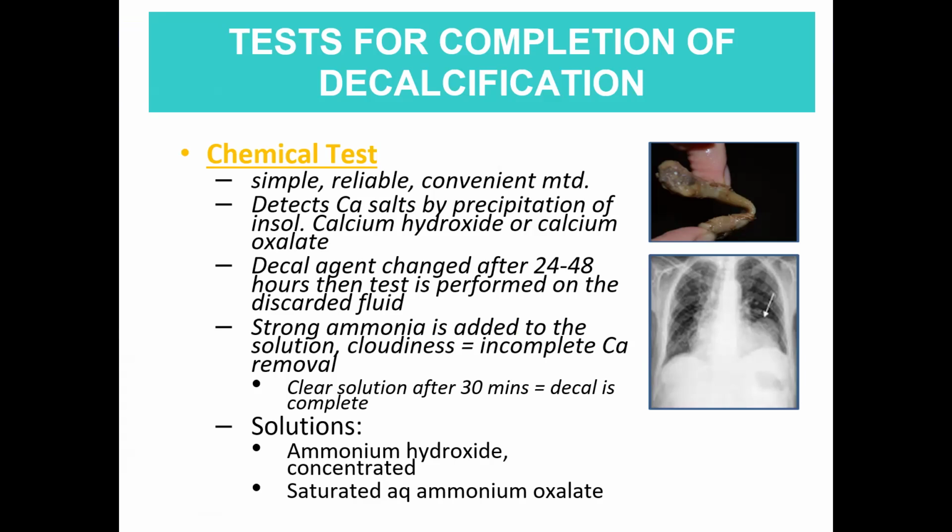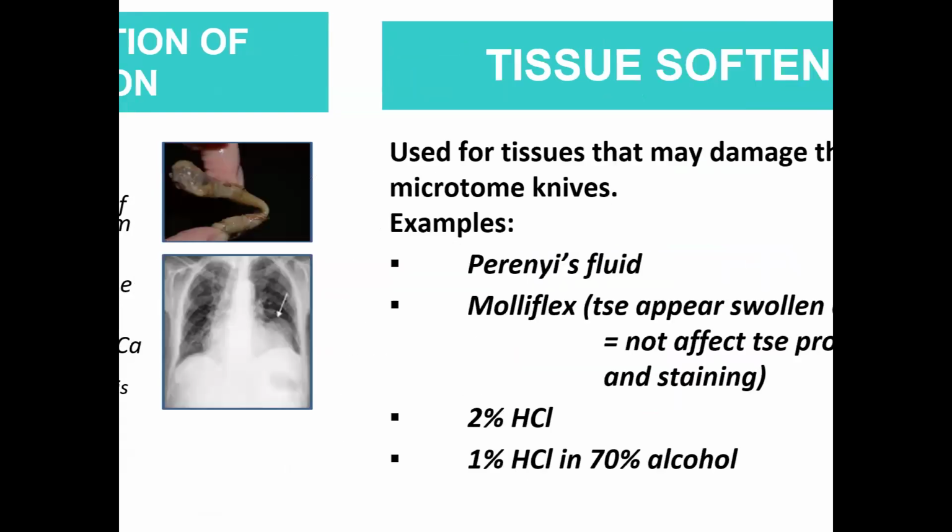As long as there is cloudiness, decalcification continues. Solutions used are concentrated ammonium hydroxide and saturated aqueous ammonium oxalate.